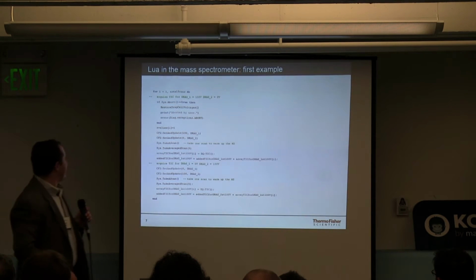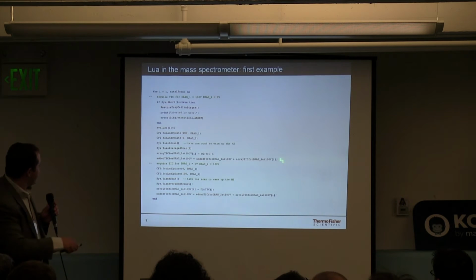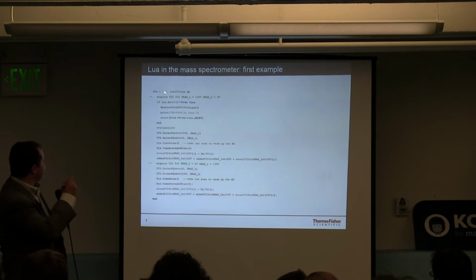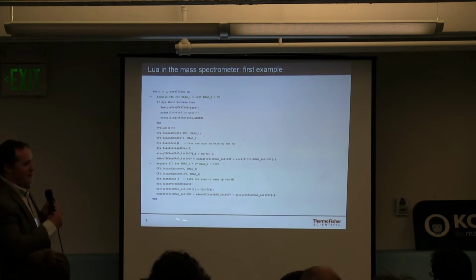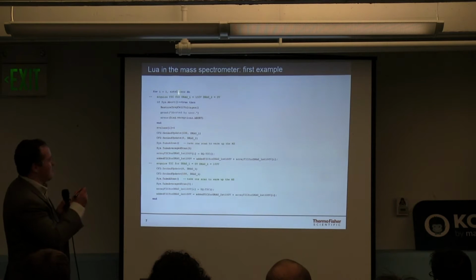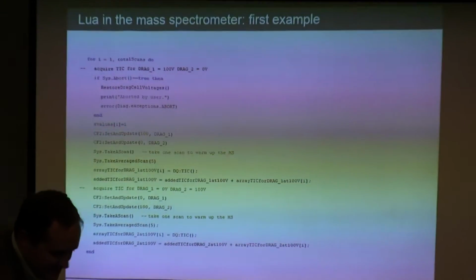So what this looks like, you take all that complicated stuff and you provide people a very simple kind of control. I was remarking to somebody earlier that we have Lua written in-house that looks a lot like BASIC, just a for loop over an integer lattice and a bunch of imperative commands chained together.